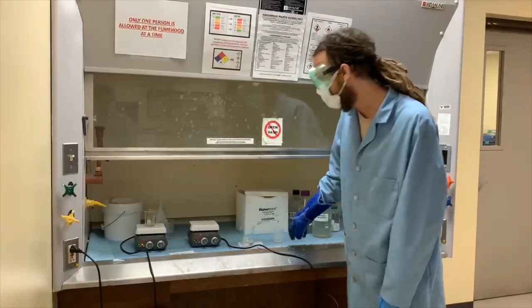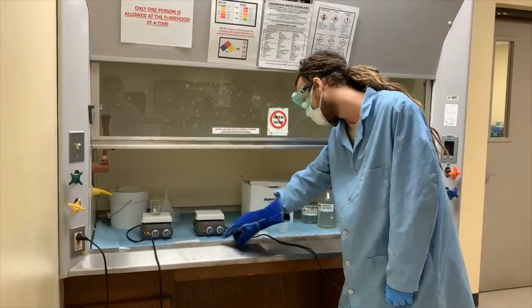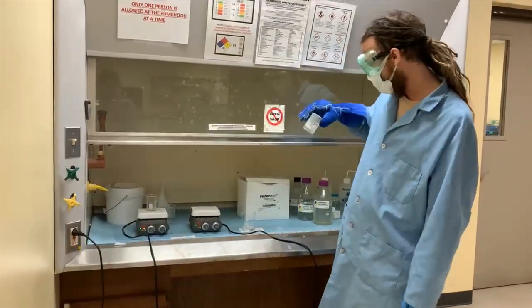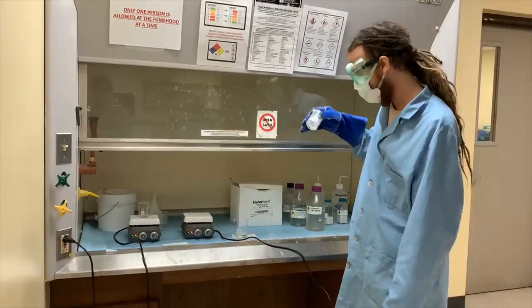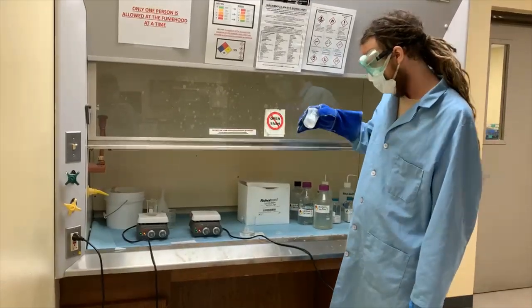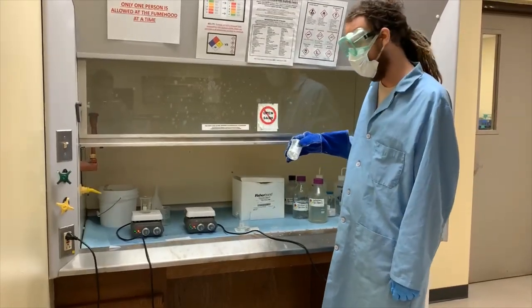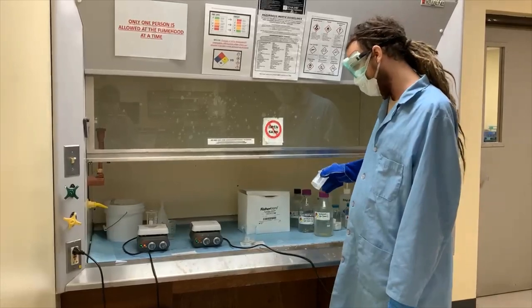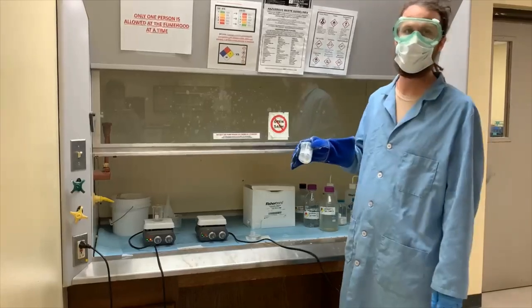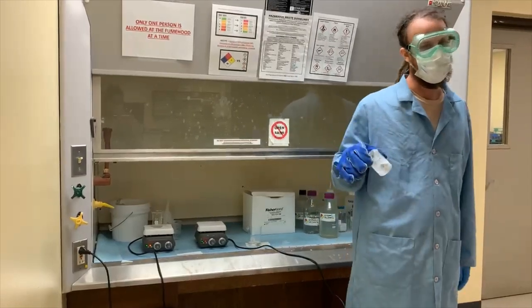Okay, so we're back. The salt water is in the process of evaporating, leaving only the salt behind. And our ethanol has been fully evaporated, leaving our salicylic acid behind. So, important thing to note is that hot glassware looks exactly like cold glassware. So be careful when handling it and always set it down so that it has a chance to cool before you weigh any hot glassware.